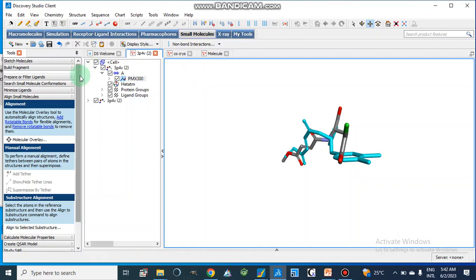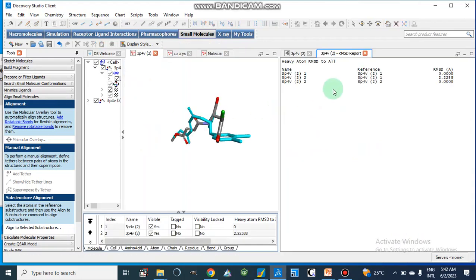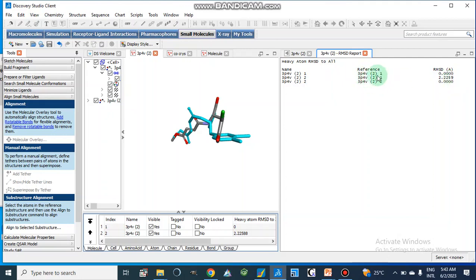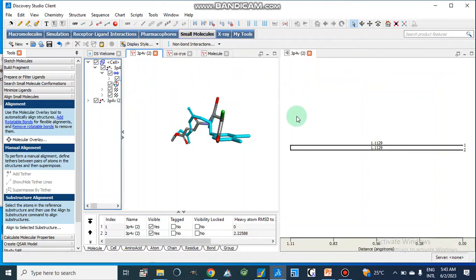Now I am going to take the RMSD values. Go to Structure > RMSD Heavy Atoms. Now this is our structure number one, which is 3P4V1, and this is our second structure which is 2.2259. This is our second structure according to this reference, which is structure one.